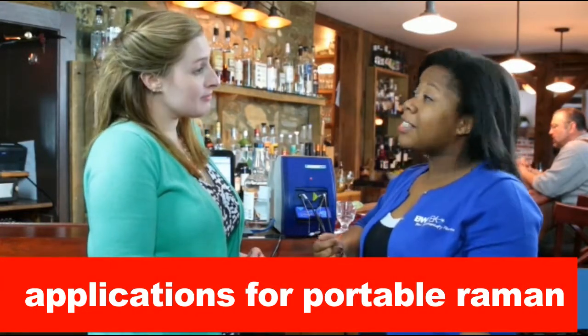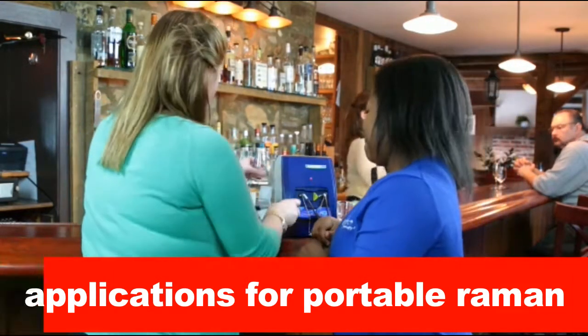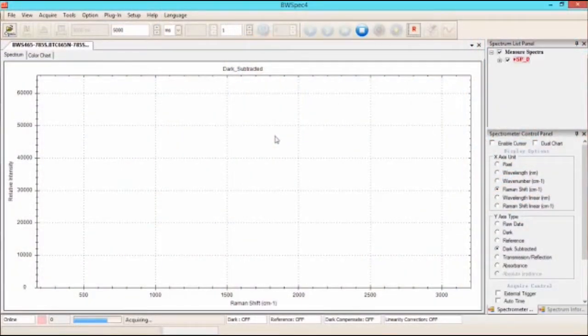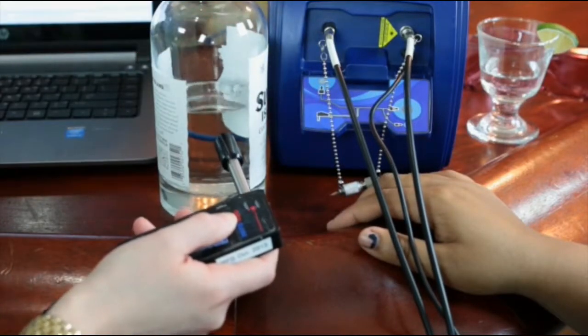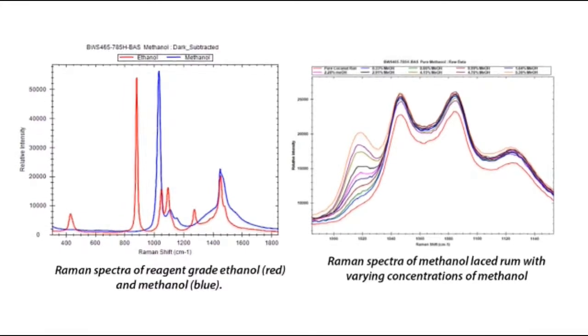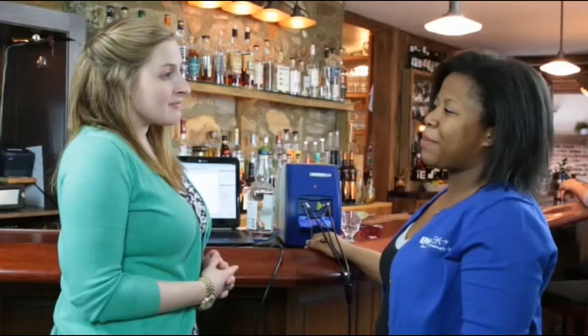Let's give it a shot and see what kind of results we get. First, we'll take a dark scan with the shutter closed, then go into the software so we can subtract that later when we take our actual scan. Now we can take our scan of the alcohol. When measuring quantification, we can actually measure down to a few tenths of a percent, and based on this you can see that our rum is safe and methanol-free. That's an interesting use for Raman spectroscopy.